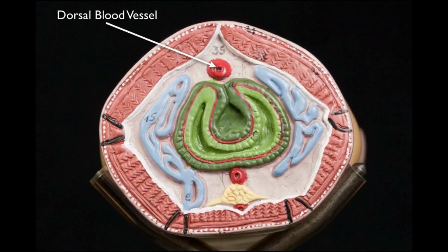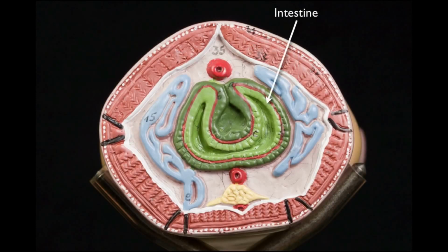Near the top is the dorsal blood vessel. The green structure is the intestine. Here you can see the lumen of the intestine, the space where food is located. Notice that the intestine is not simply a hollow tube. There is a fold of tissue hanging down from the top. This is the typhlosole. It is thought that this serves to increase the surface area for absorbing nutrients.